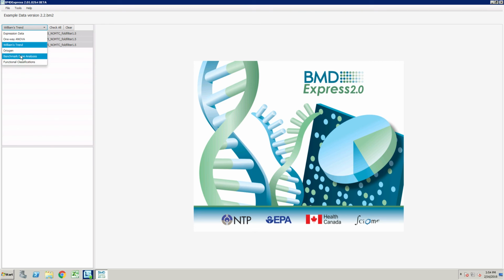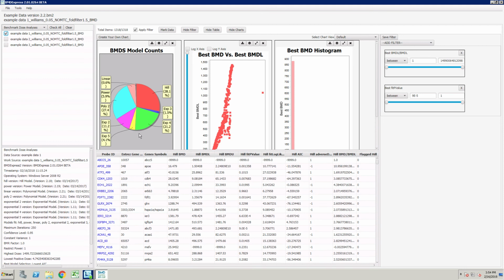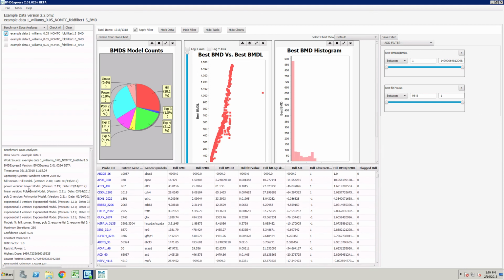The next section down, or analysis section, would be the BMD benchmark dose analysis. And so here are the 3 benchmark dose analyses, and you can tell it's a BMD file by the fact that it says BMD. And so what you can do here, in order to see the analysis, you select the button here, and it gives you a number of different visuals that break down the results of the BMD analysis. And then you get all the details over here of how the analysis took place.